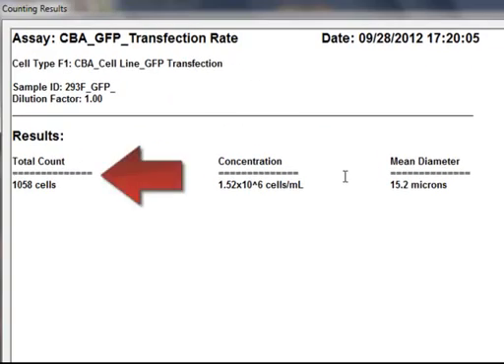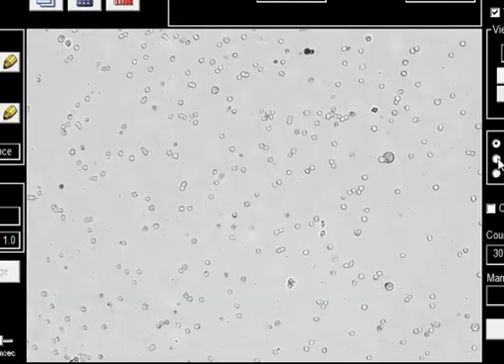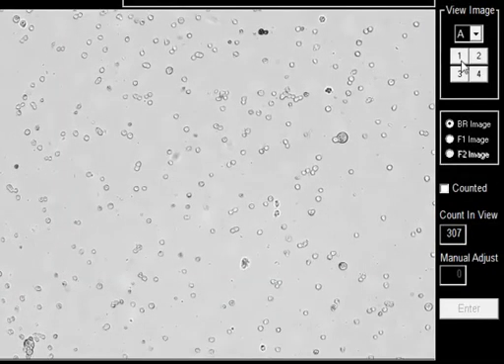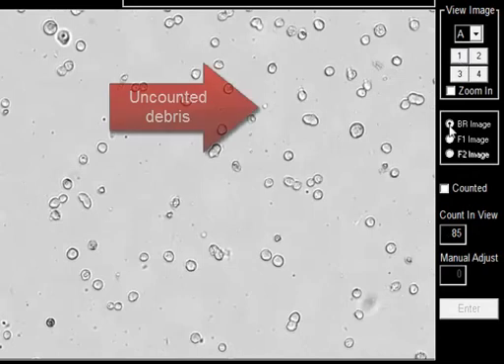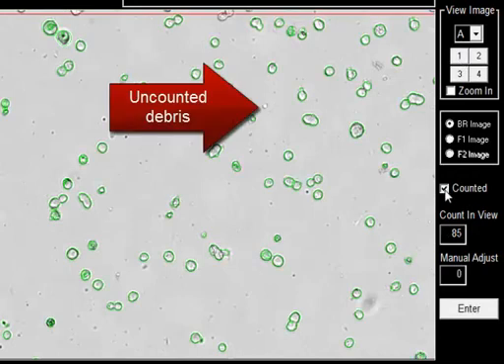The total number of cells is calculated from the bright field images. Debris is excluded from cell counts based on size.